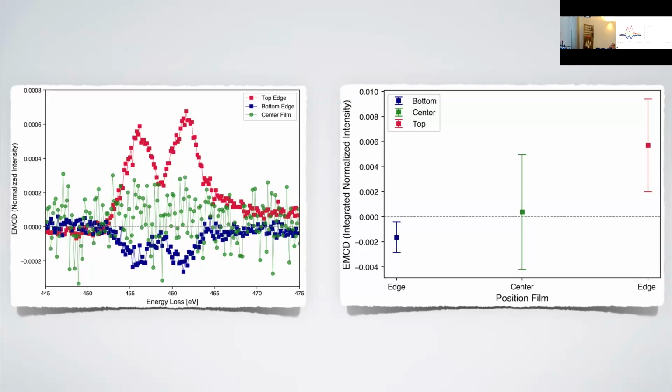Yeah, so I'm showing you the best data, but I have more data where this systematically gets reproduced. The important thing at the end of the day is the signal-to-noise ratio, and you can see directly in the data whether there are wide error bars. When I tried to do the experiment, I went to PNNL because I have a joint appointment there. I was going to use the Spectra, but the K3 camera, the electron camera, was down. So I had to use the Talos with a CMOS detector, and I got what I got. Since I don't have the microscope to do it all the time, it's one day, move on.